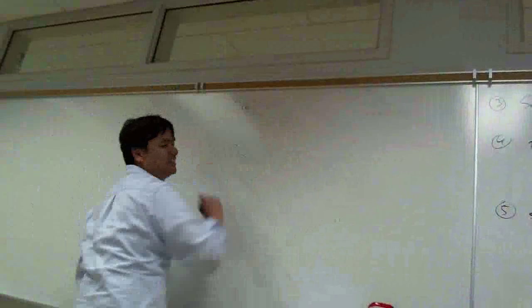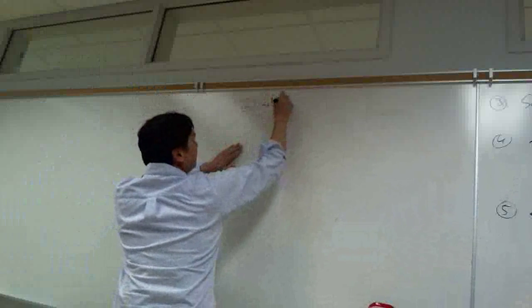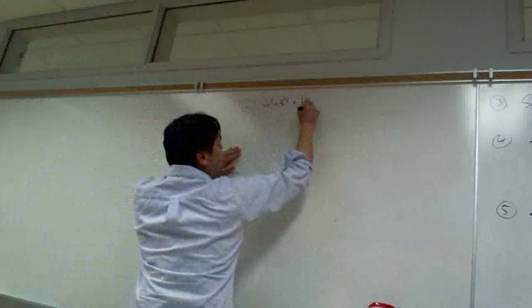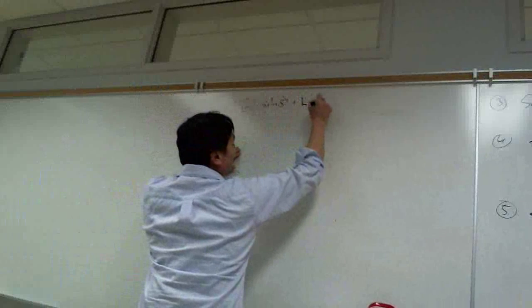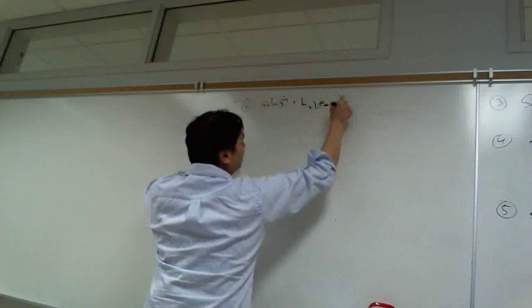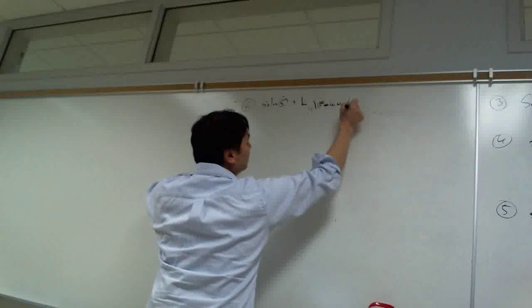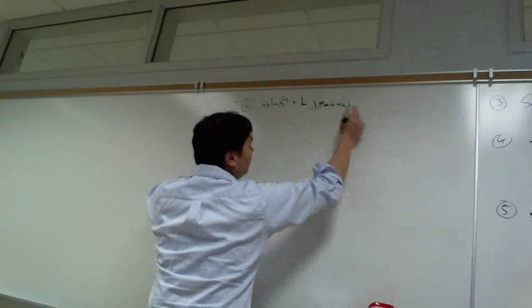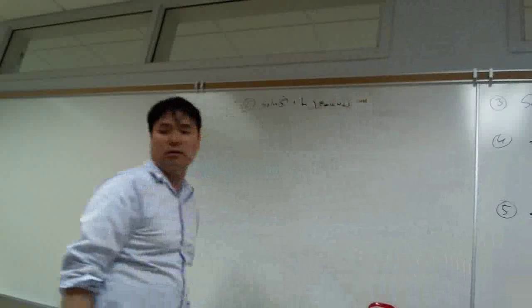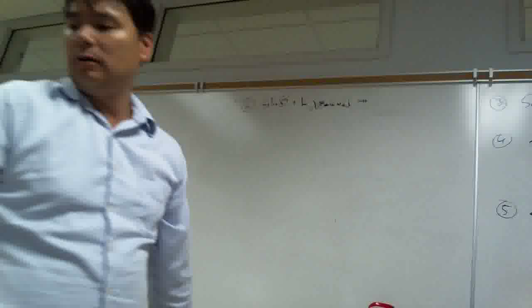Step 6. And we have potassium hexacyanoferrate. And so we'll take the solution from 5 plus potassium hexacyanoferrate, K4, and this is going to yield a precipitate, a gray-blue precipitate.